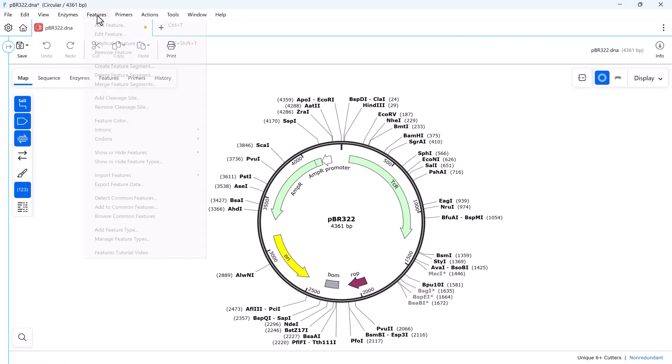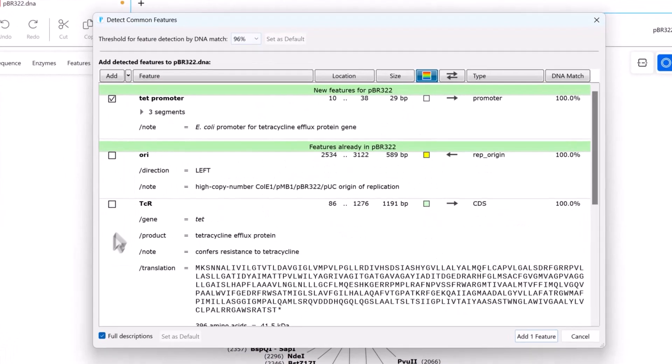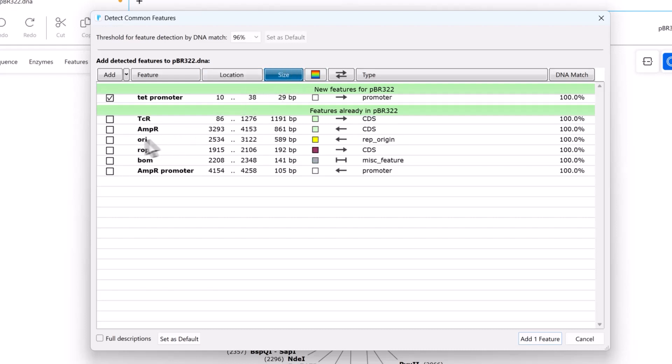The Detect Common Features option allows you to match, view, sort, and add features to your sequence.